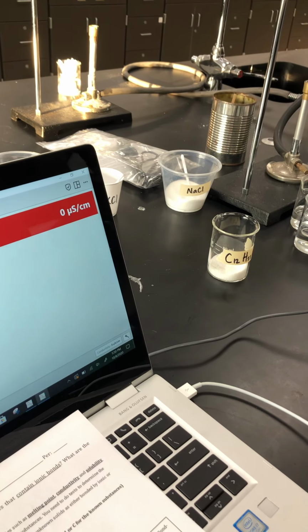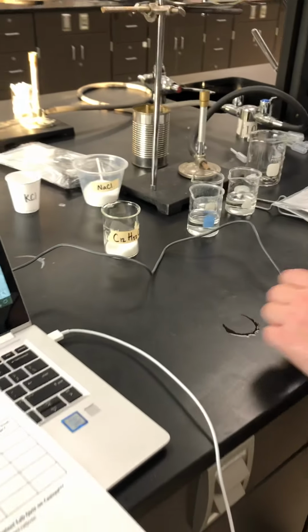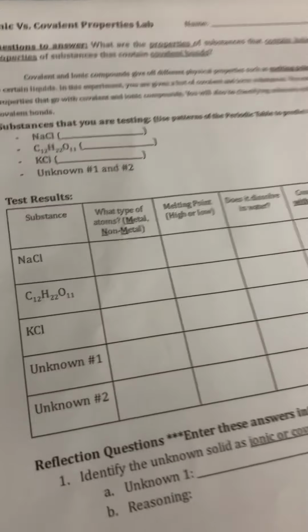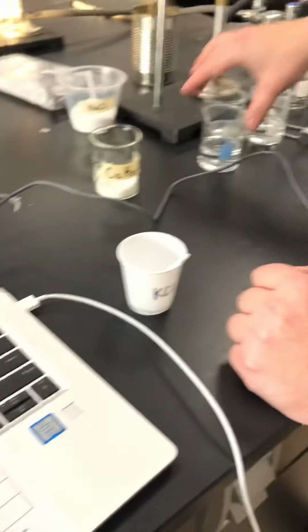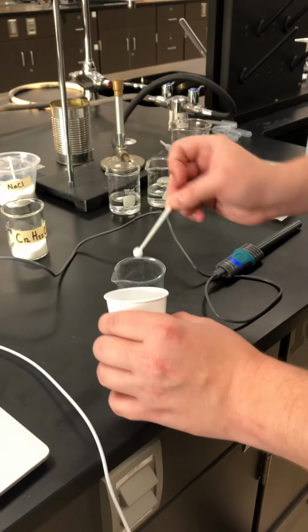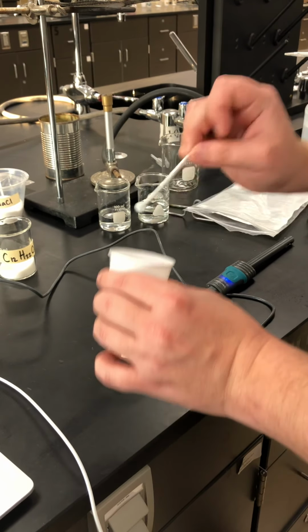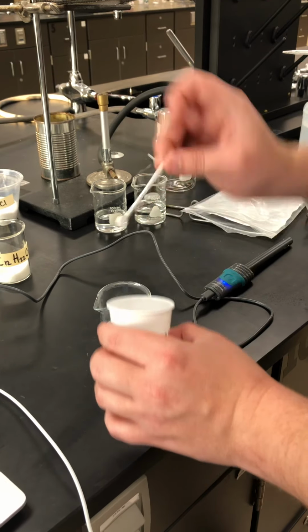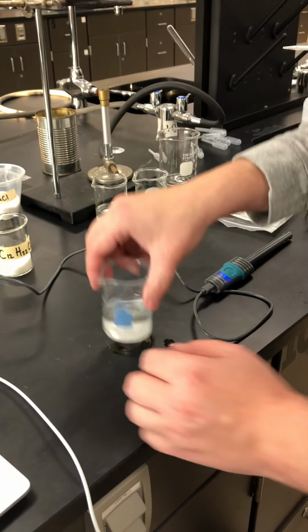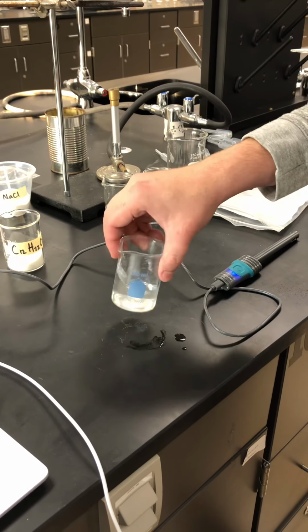So we're going to rinse until we get to 0. That's good. Our last known chemical is potassium chloride. Three and 4 scoops of that. Give it a little stir.